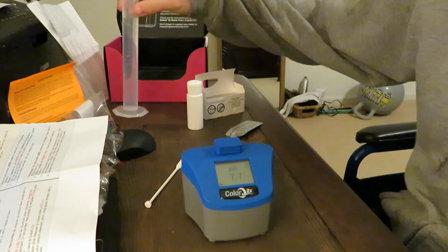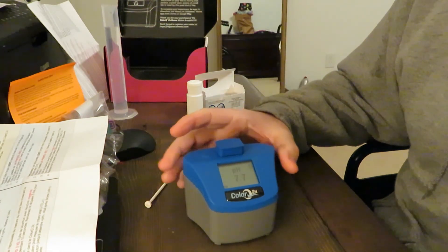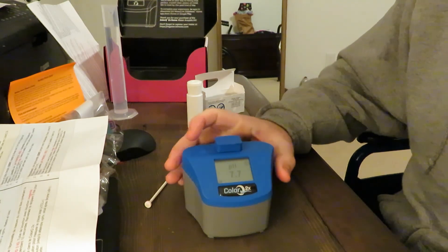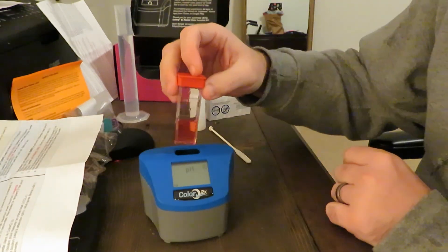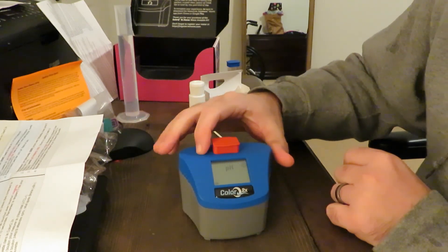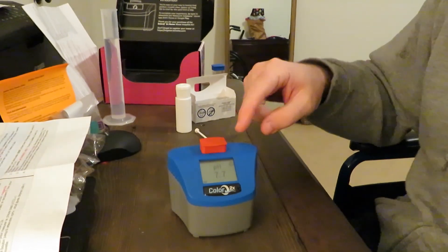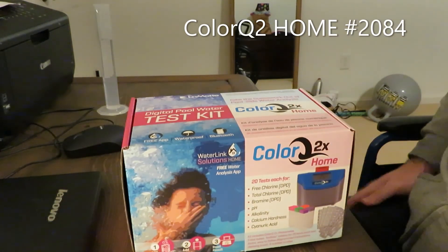And it is going to give us a reading of 7.7. This is my filtered water from my fridge — I tested that and got 7.7. I'm going to run a second test with my unfiltered water and then retest to see if my results are accurate. I'm simply going to put this in, press the button. Last one was 7.7, and this one is also 7.7. I got very similar readings for both.